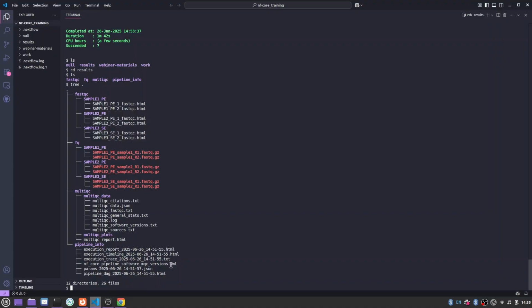You can now download and run an nf-core pipeline, and you could go find one on the website and look at its inputs and its outputs and what was required for it. You should be able to run it with its test config. I am going to give you a challenge here, which I will go over the results for.